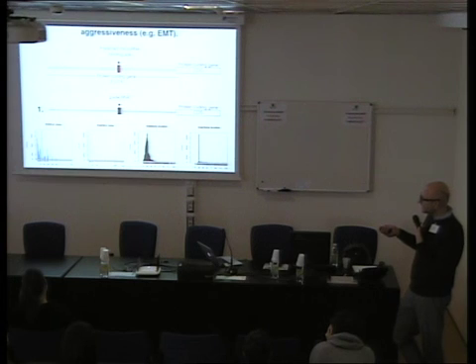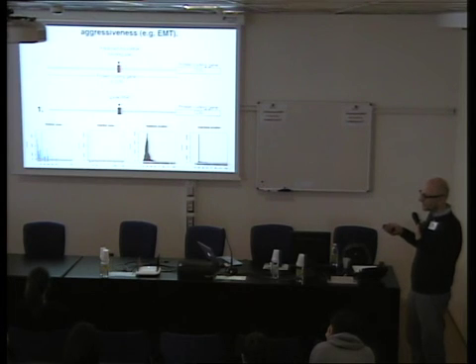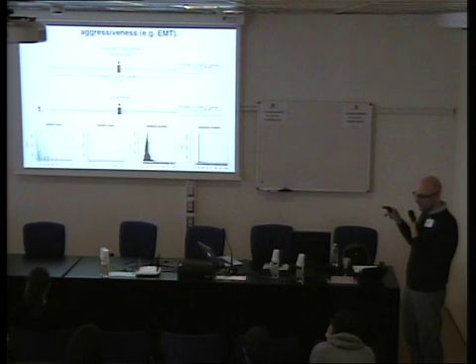You get the deletion size. So this means one nucleotide deleted up to 76. So this is the range of deletions that you get when you design a guide RNA for your sequence.